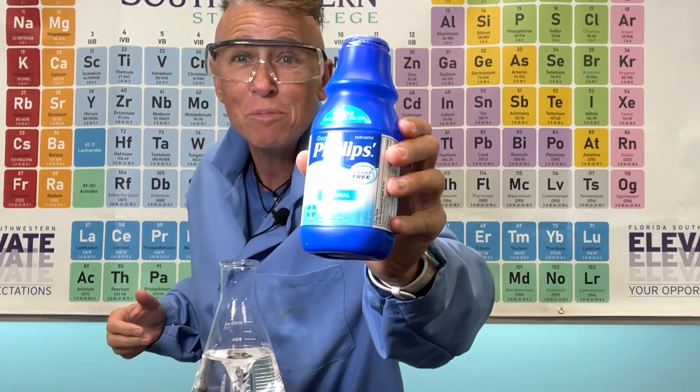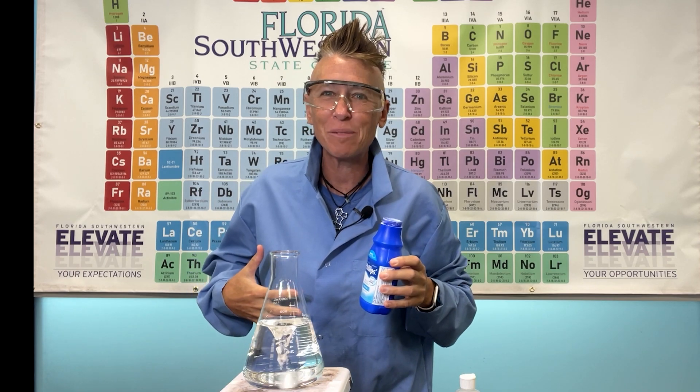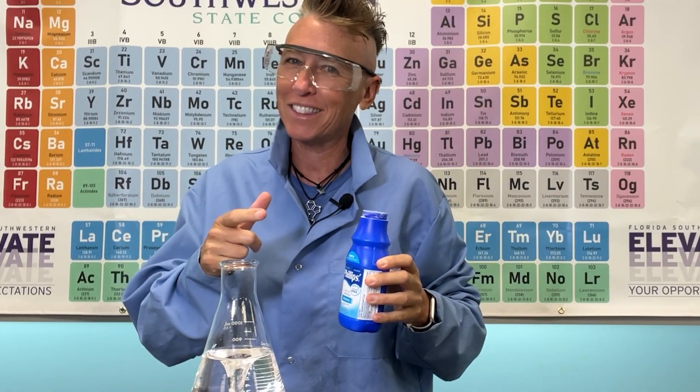Have an upset stomach? Have you tried milk of magnesia? What is happening when we put this inside our stomachs? Chemical Kim is going to break down the science.